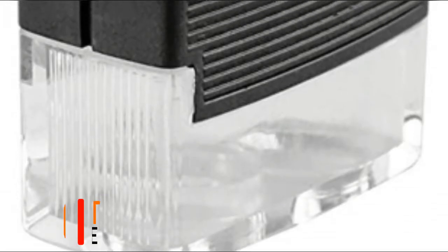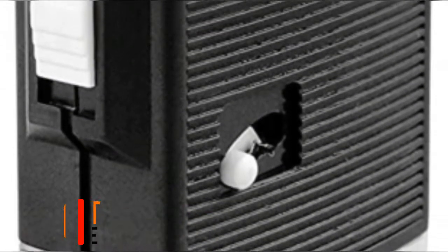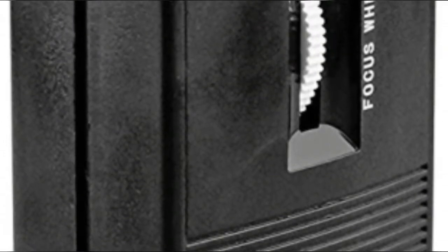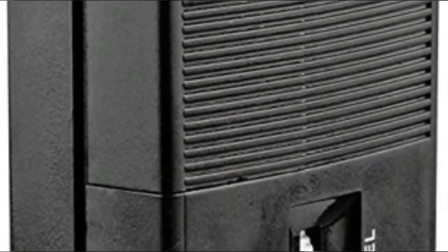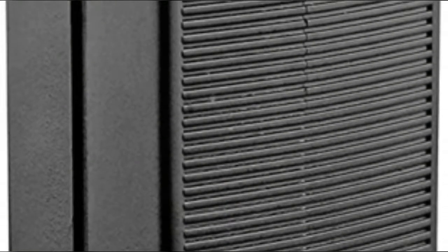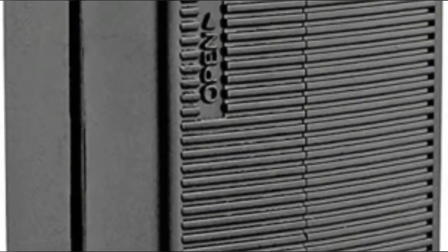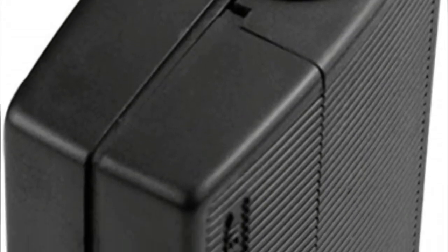Hello, now you are watching best handheld microscopes. Number one, LED pocket microscope. Powerful magnification 30x for viewing the finest details, adjustable bright LED light. Up to 45 degrees toggle for two modes, flashlight and microscope. Focus wheel for control adjustment, viewfinder, power on/off button. Requires two AA batteries not included.